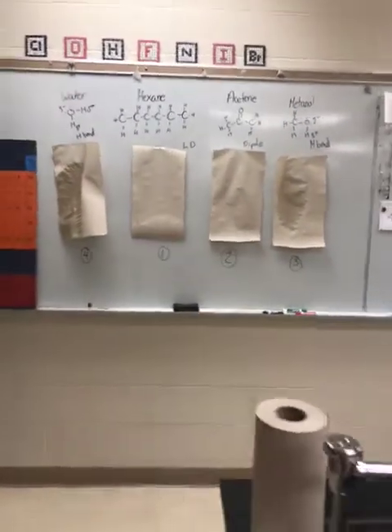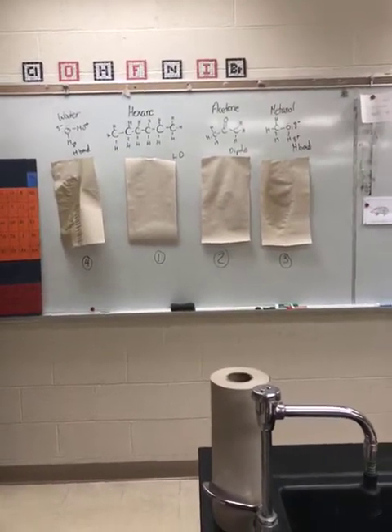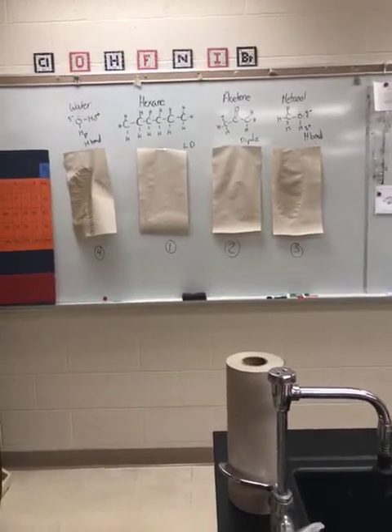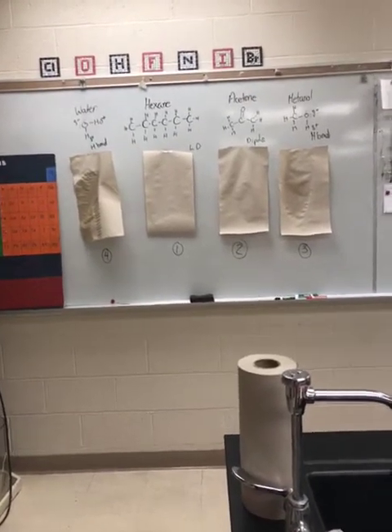It definitely looks like the methanol is evaporating faster than the water. So you always assign the types of intermolecular forces, rank them, and from there you can come up with all kinds of properties such as evaporation rate.